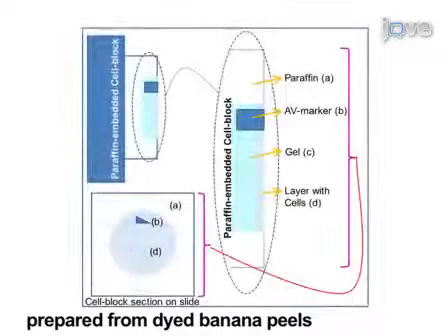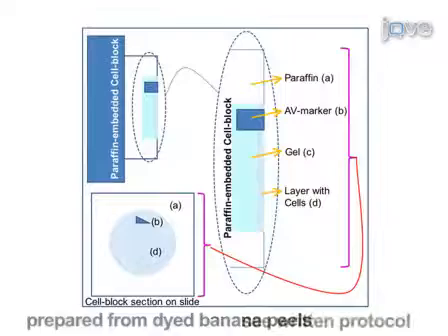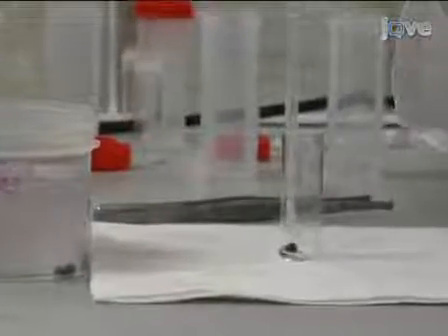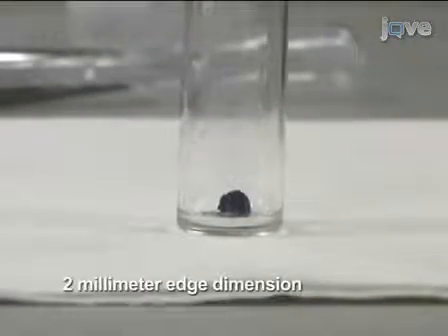A dark beacon, or AV marker, is added to the cells as a signpost. After the cells are embedded, the AV marker serves to identify the level at which the cells are concentrated within the paraffin block. Using a special pipette, add a previously prepared AV marker flat surfaced cube to the cells in the tube.